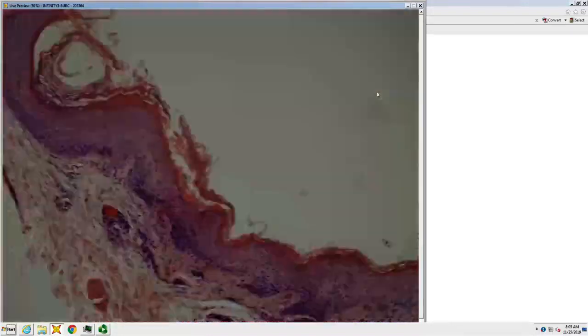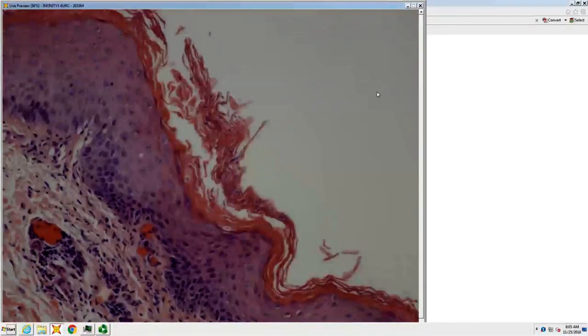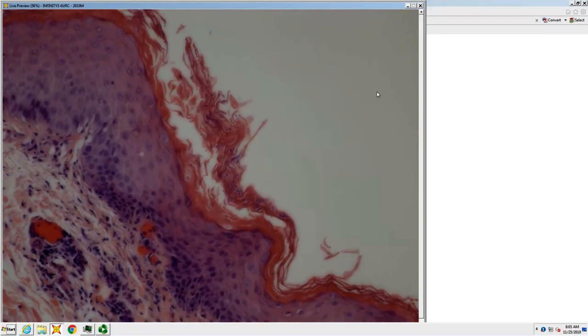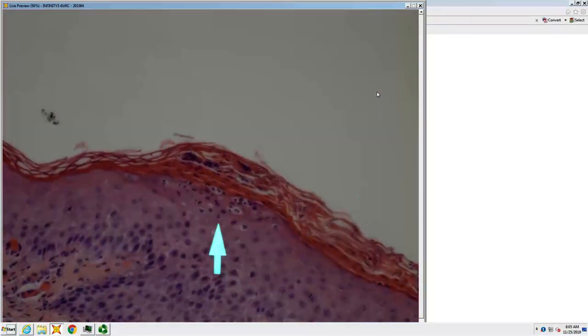Some of the horn looks like seb. Oh. Are those vertical? They are vertical. And I'm trying to think if it's either erythrasma or Candida. Does that help you at all?